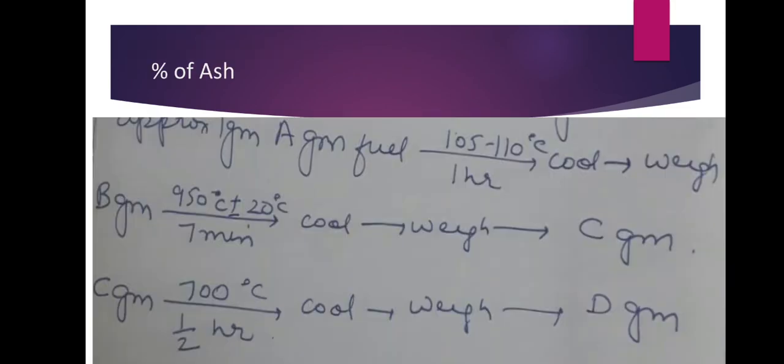Next we determine the percentage of ash. Now the percentage of ash is determined by the same method which is used in proximate analysis.